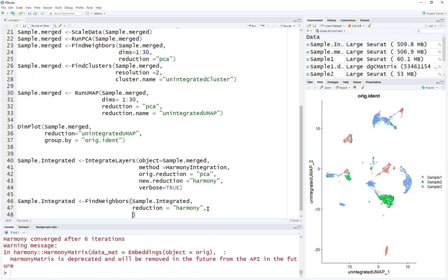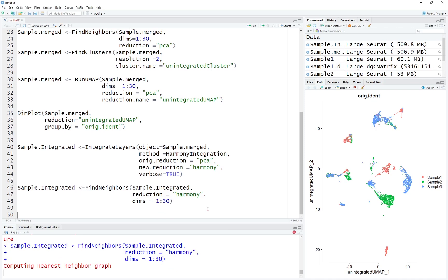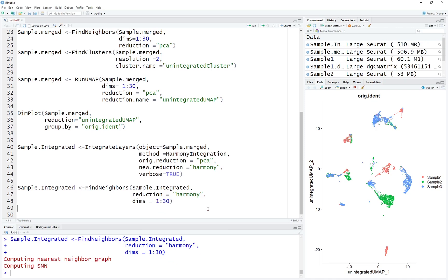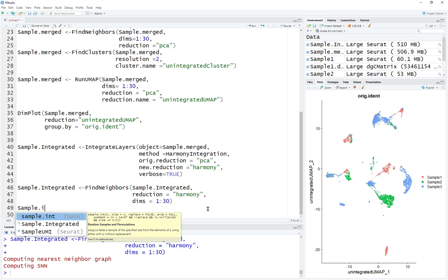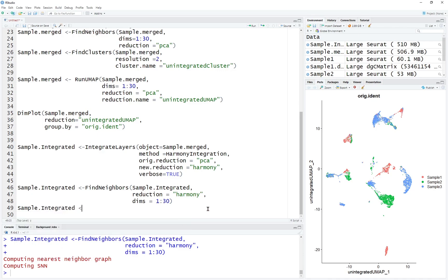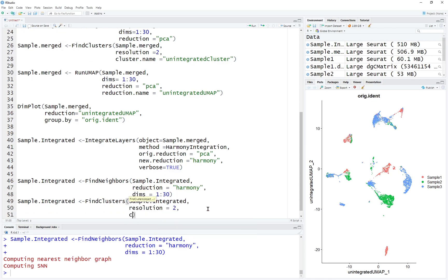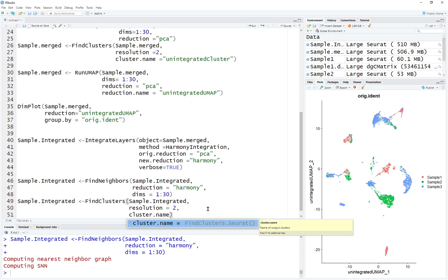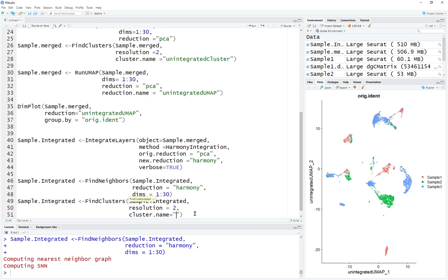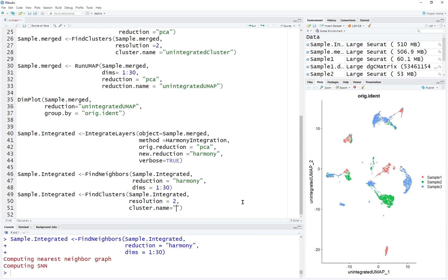The dimensions we're going to use is 1 to 30. After integration, let's find the clusters — FindClusters on sample integrated. The resolution will be 2, and the cluster name — you can name it anything since we'll recall it when visualizing. Let's call it harmony cluster.